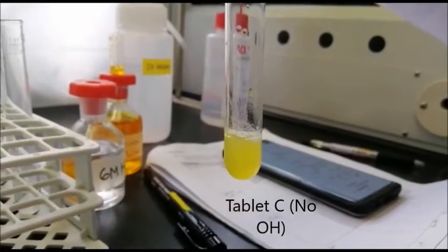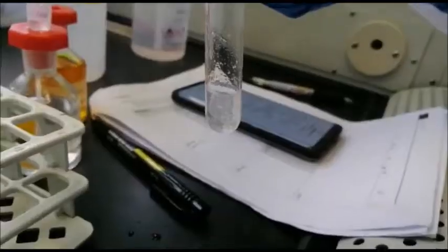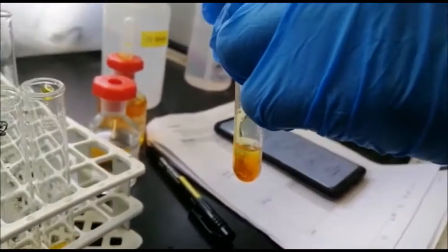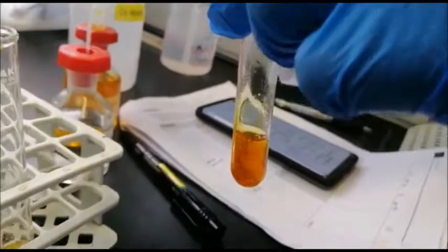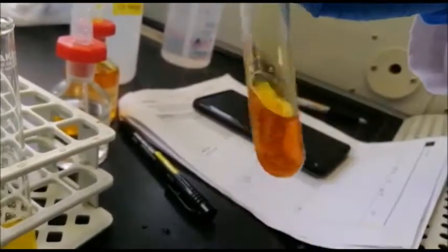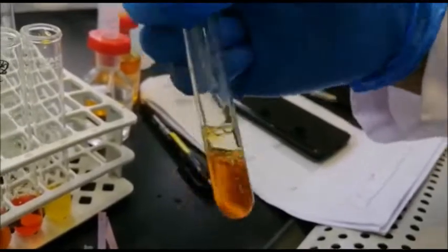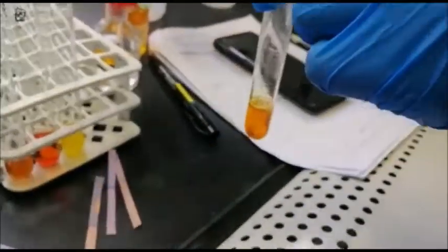Drug A also reacted with the ceric ammonium nitrate. This was unexpected, as we did not think that phenols could also produce a reaction. However, further research proved that this was indeed the case, thus our expected results were incorrect. Phenols can form a dark brown precipitate with ceric ammonium nitrate.